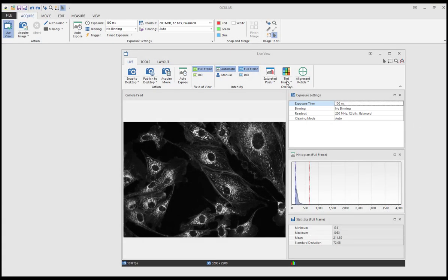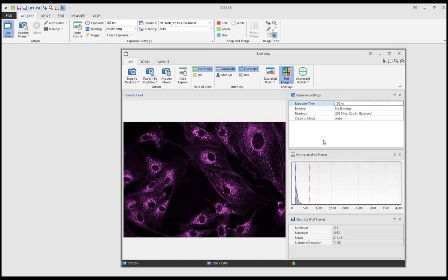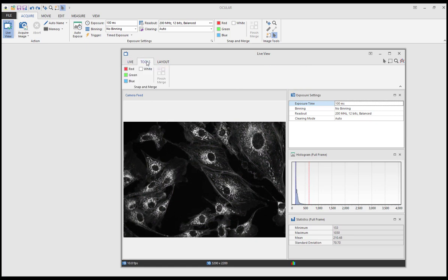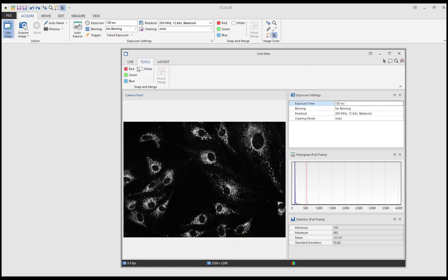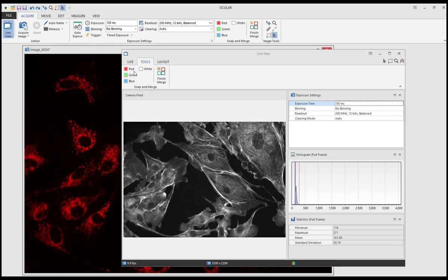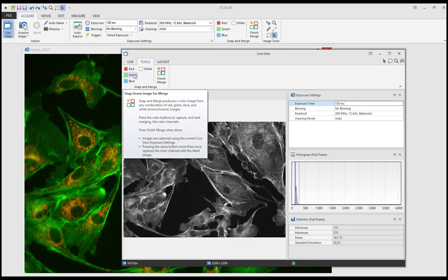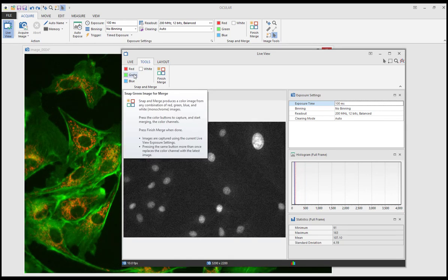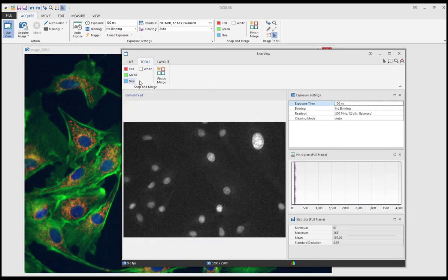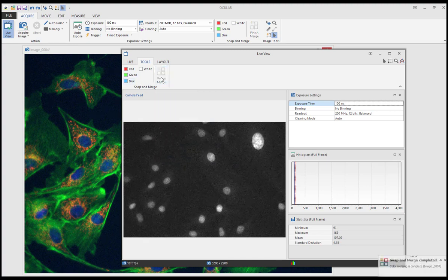You can tint your image in the live view by selecting the color you want under tint image. If you want to image using a red, green, and blue channel and then merge the image together, you can do that under the tools tab. Ensure that you select finish merge when you're done.